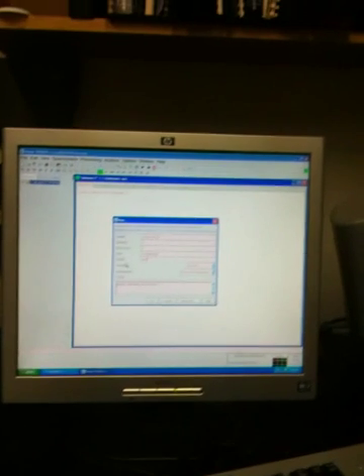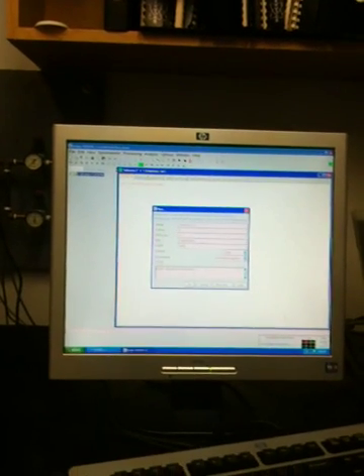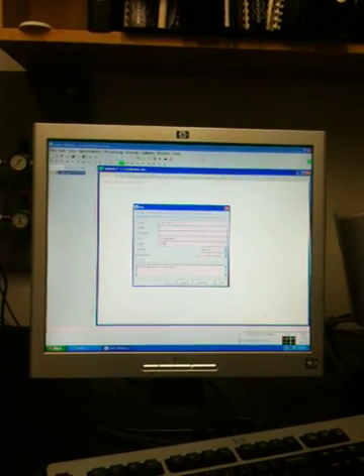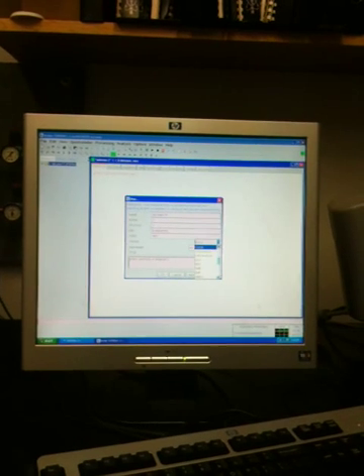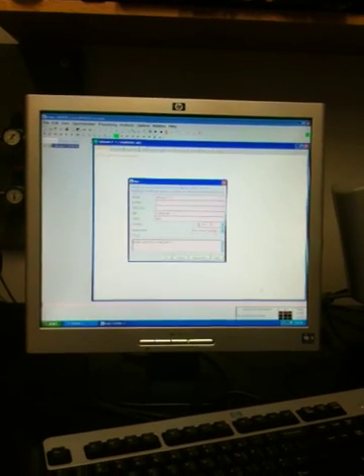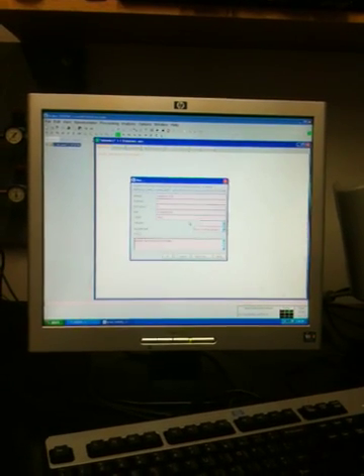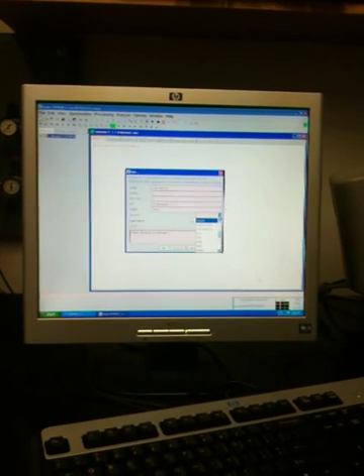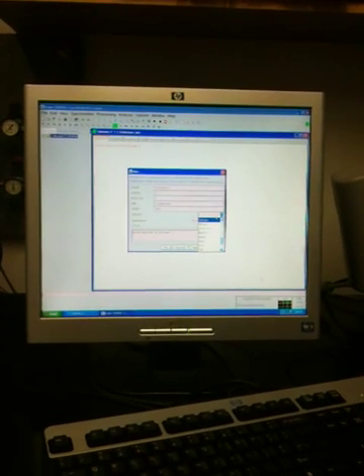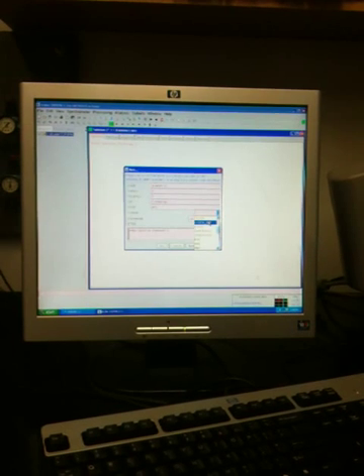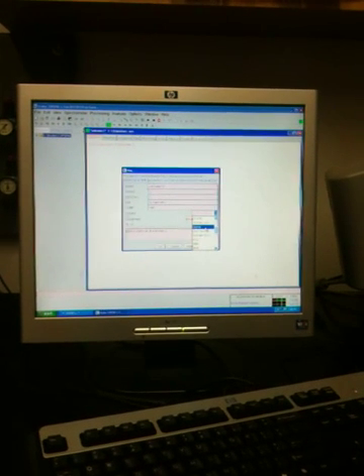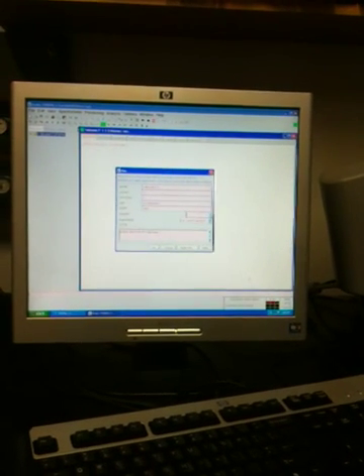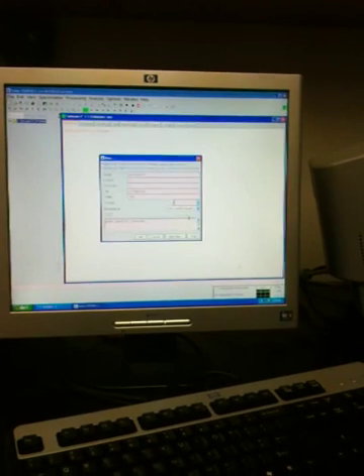What you need to type in is the solvent you're using. And as you'll recall, we're using deuterated chloroform. Now, to get that, you just scroll down. So if this were in here, you would just scroll down to deuterated chloroform, CDCl3, and click on it. It didn't go in. I'll try again. Here we go.